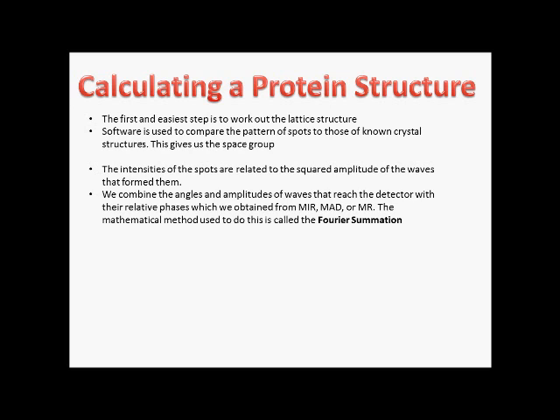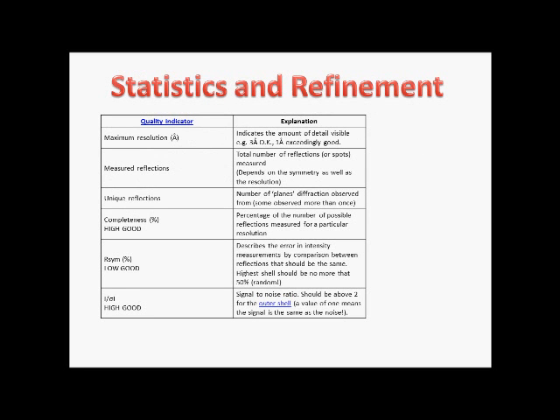Resolution is a measure of how far apart 2 points have to be before you can distinguish between them. Reducing the wavelength of your X-ray helps you get, in theory, a better resolution, but in practice the resolution is always determined by the quality of your crystal and the crystallography experiment, so it will only help if it's been a limiting factor. The rest of these statistics are fairly self-explanatory, and there's more detailed information on them in the online resources.